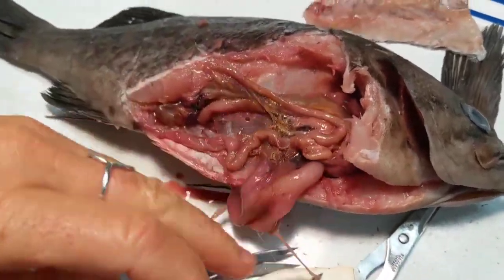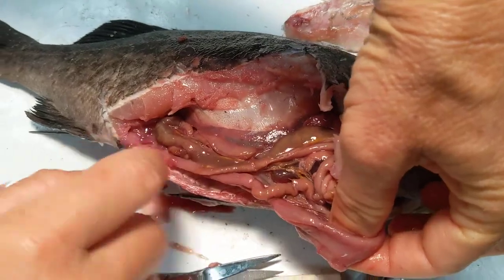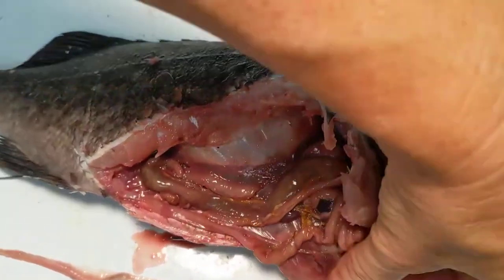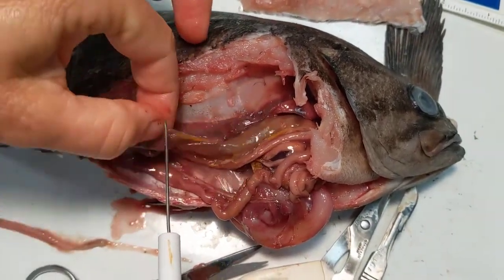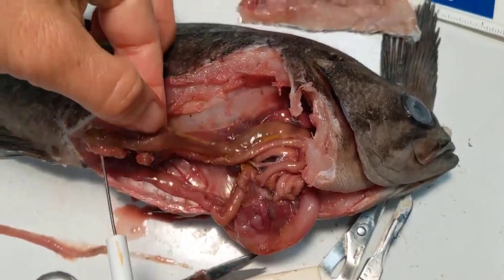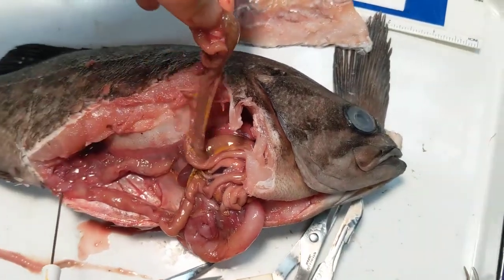You see that it flows down to the intestines. And if you follow it, you can see this darker intestine where the more digested stuff is. And then it was just connecting to the anal opening there, so we'll just move that aside.